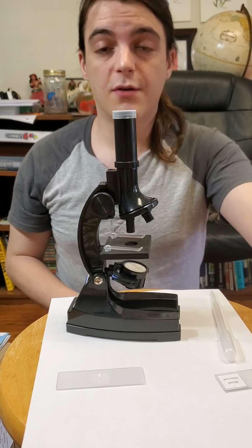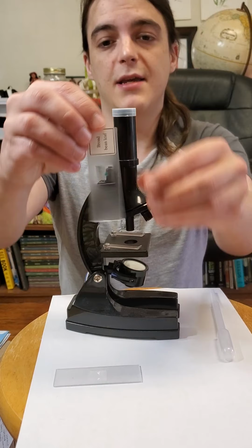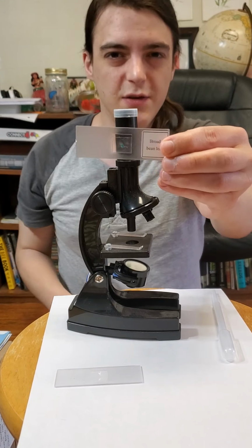Most of the samples you're going to use in this type of microscope are going to be on what's called a slide. See here, I've got an already prepared slide. It is broad bean leaf, a little slice of a broad bean leaf.